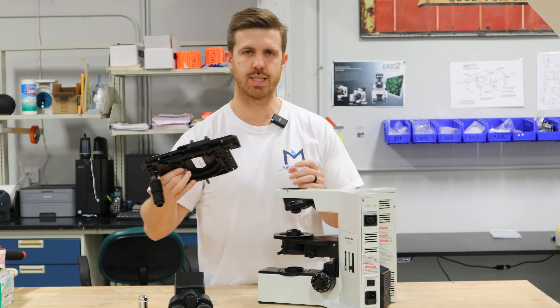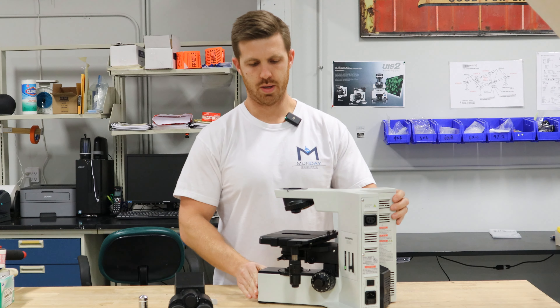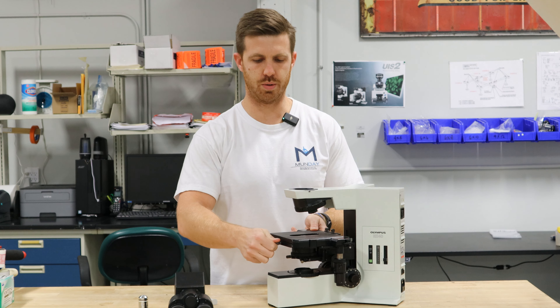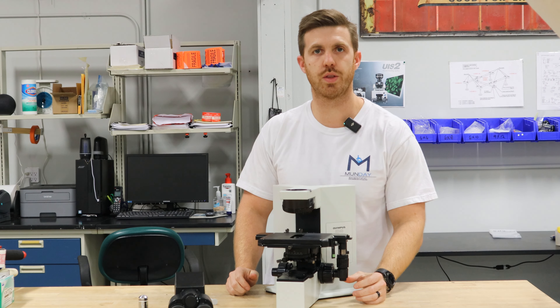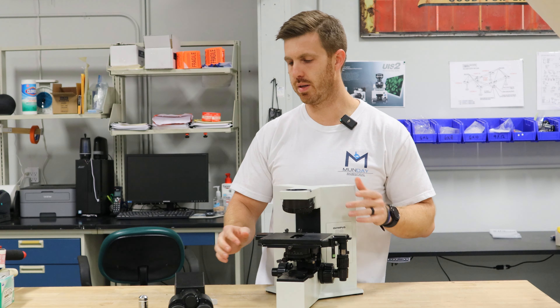Then you're going to take the stage, lower the focus down, set it on there, and tighten that thumb screw. Once the thumb screw is tightened, make sure it doesn't wiggle and that it's even.